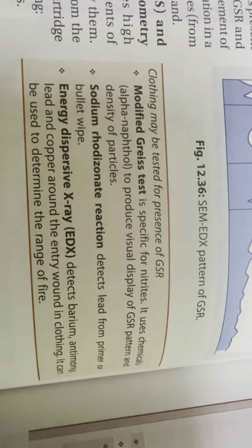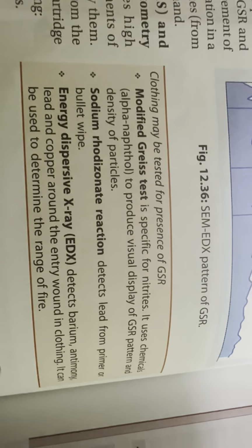Rhodizonate reaction detects lead from the primer or bullet wipe. Energy dispersive X-ray, EDX, detects barium, antimony, lead, and copper around the entry wound in clothing. It can be used to detect the range of fire.